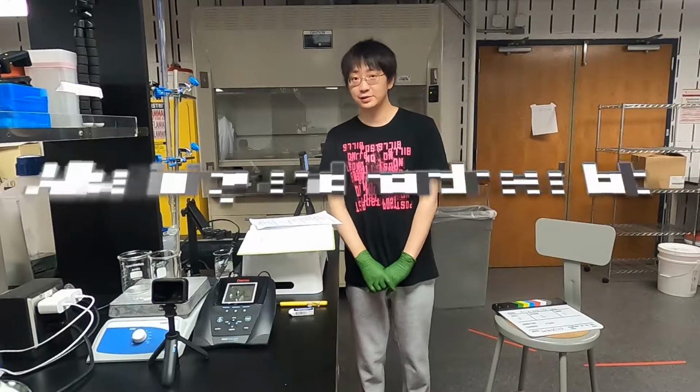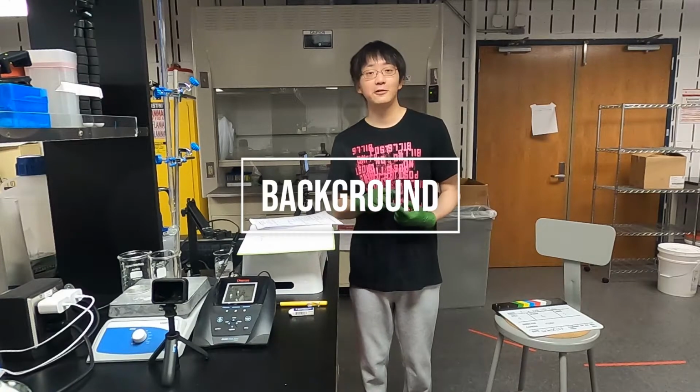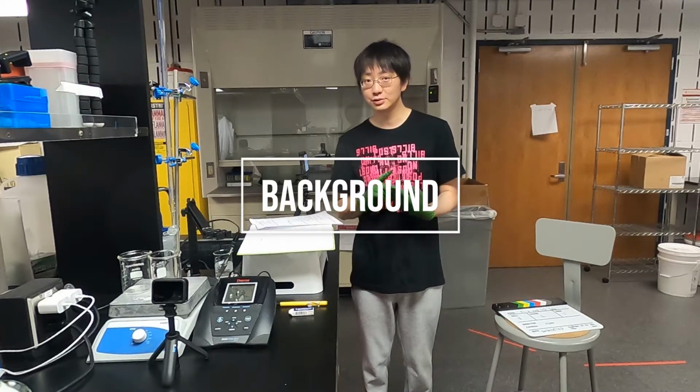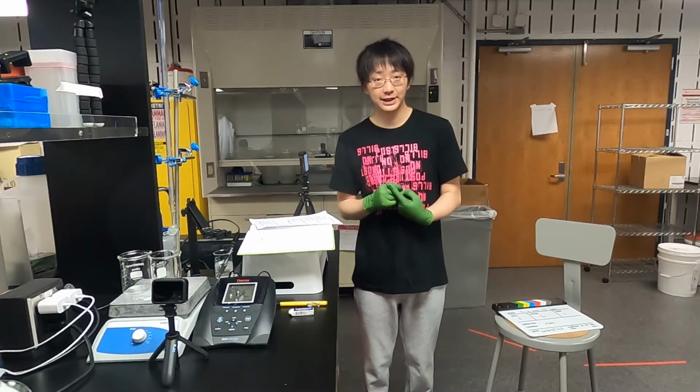Hello everyone, this is River and today we are going to measure alkalinity and hardness. But before we get started, I would like to go through some of the background. So first, let's talk about the carbonate system.